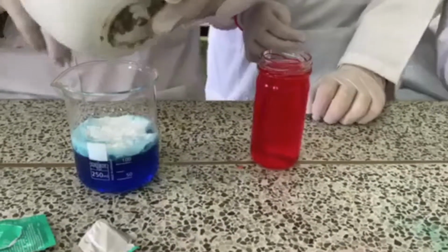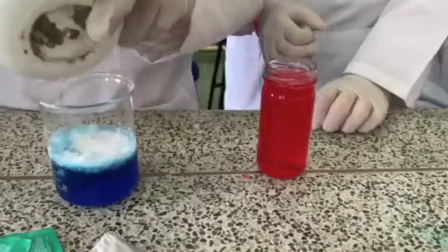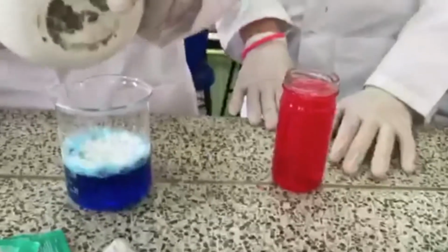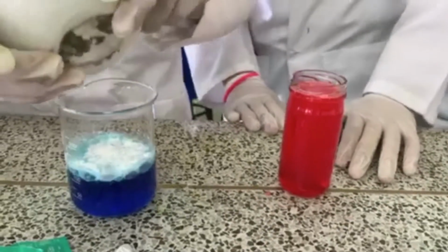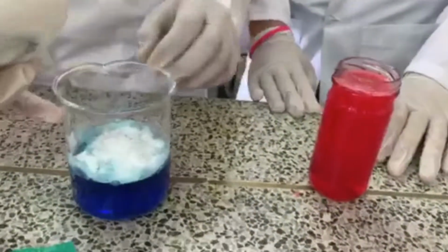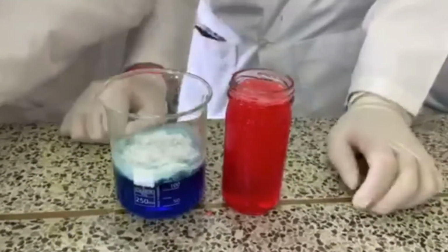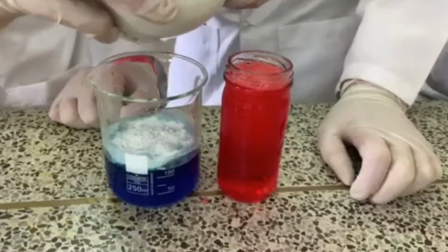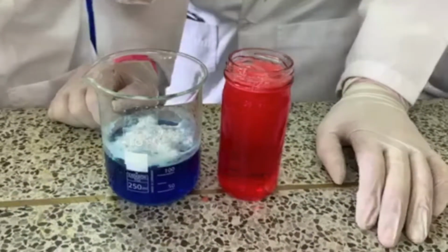After this, we're gonna add at the same time an effervescent aspirin to one of the beakers, and to the other we're gonna add effervescent aspirin in powder. To powder the aspirin, we use a mortar and a pestle. Then we're gonna measure the time with the timer from the time you add the aspirin until the end of the reaction.